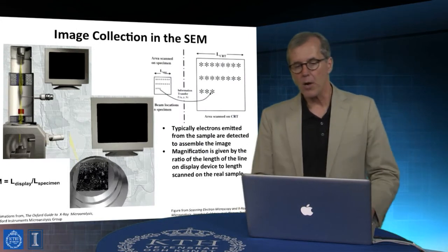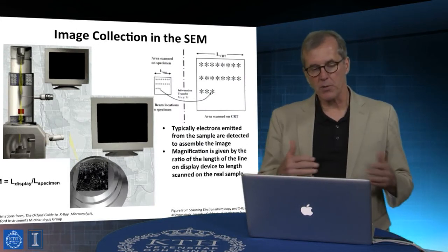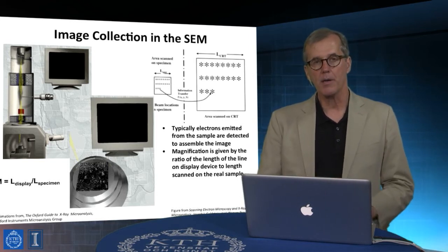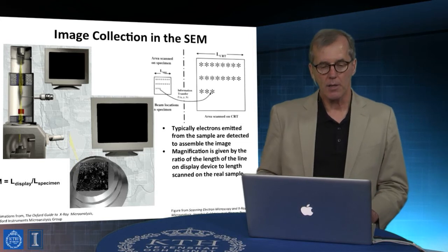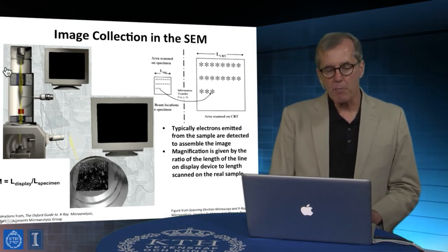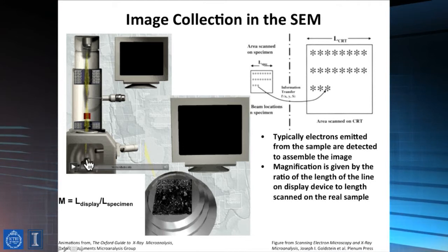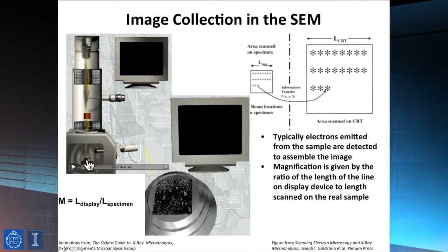Okay, so how do we acquire an image? Well, first and foremost, we use an electron beam as the primary interrogator of the material surface. So an electron microscope will have an analytical column which defines all the features associated with how we get electrons into the sample. So this is the sample region at the bottom. Because we're using electrons and because electrons interact very strongly with matter and there are large distances involved, this is all a vacuum environment.